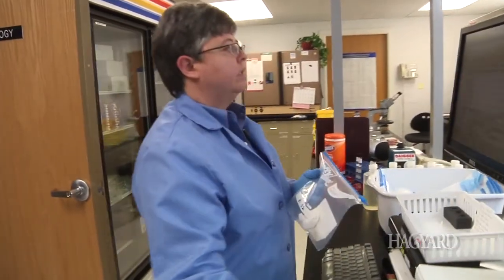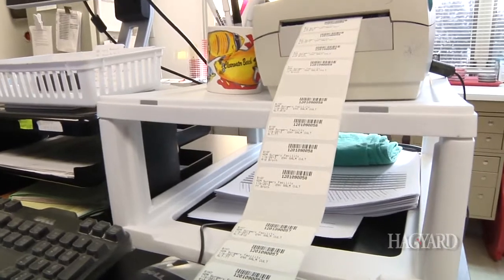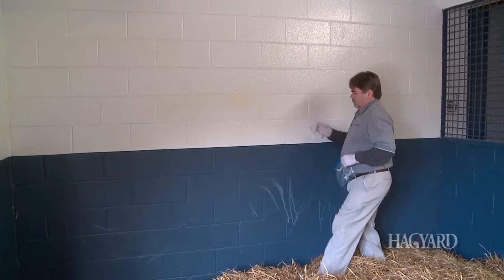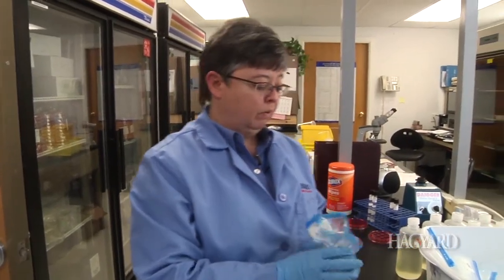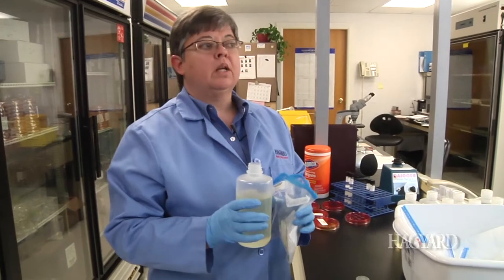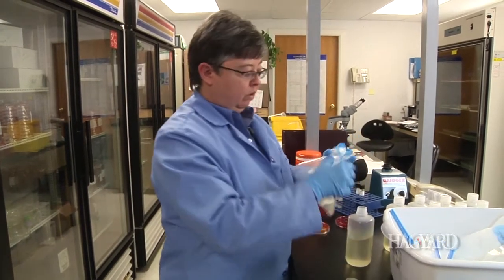I get it logged into our computer system so it can produce labels that have barcodes and accession numbers that will be unique to this sample throughout the culture process. And that's one of the great things, Tina, is having this barcode system, because it reduces any sort of errors that can happen, and we can track it and log it into the computer, so if I have any questions about environmental sampling, I can quickly access the data. Yes, we can generate reports for the doctor of any positive or negative samples or environmental patient samples, depending on what his needs are for the day, so he can track and monitor results.